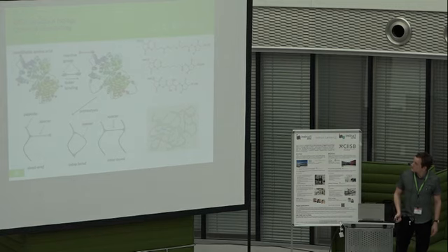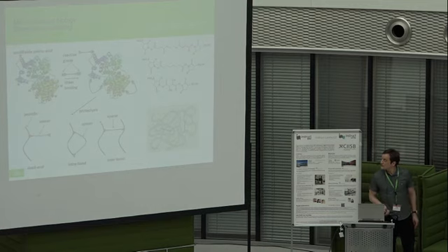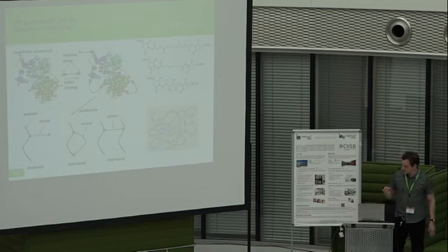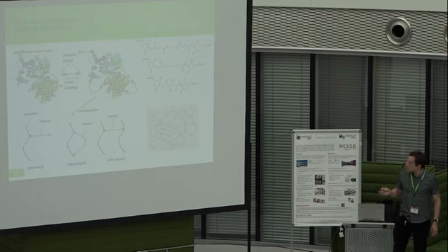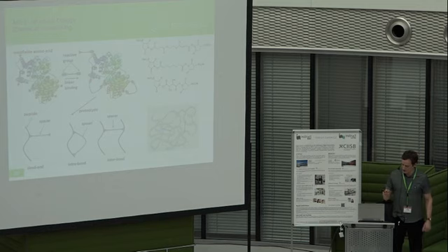Also, the treatment of the MS data is not very easy because there are many kinds of peptides, many kinds of fragments, and in fact every linker needs another data treatment software. Nevertheless, after you obtain the result, it really has a high informative value, and the distance between the amino acid residues usually then correlates with other methods. It cannot be presented alone, because this is not the absolute method, but usually it is now being introduced as one of the standard methods determining the protein structure.